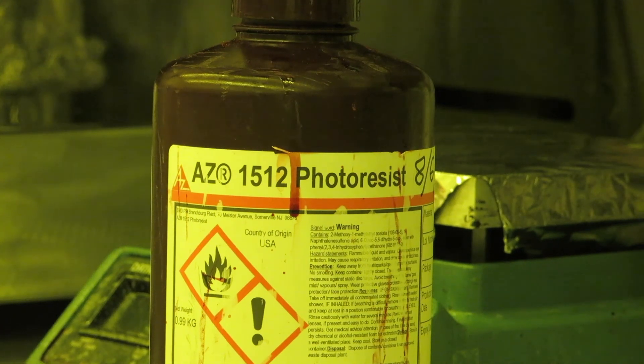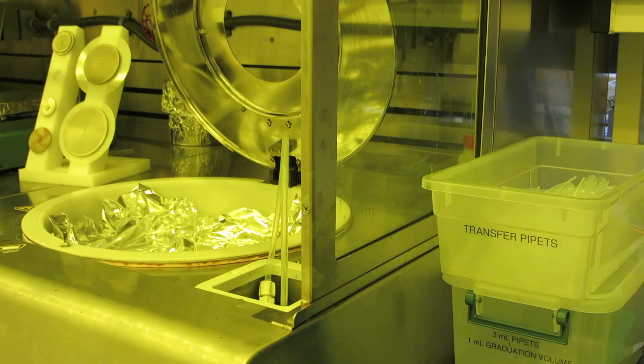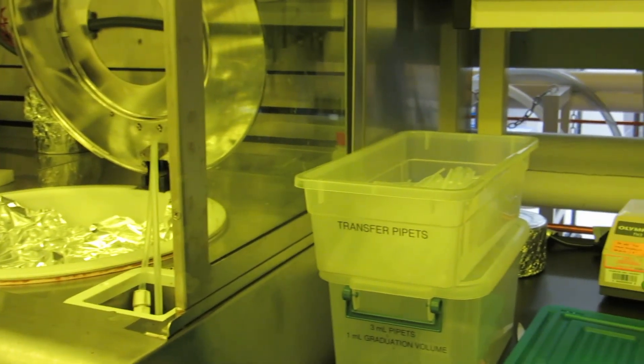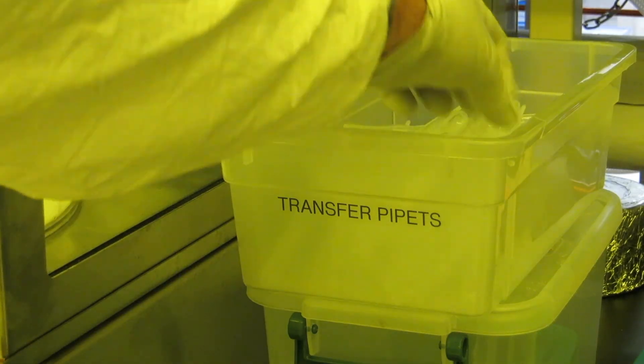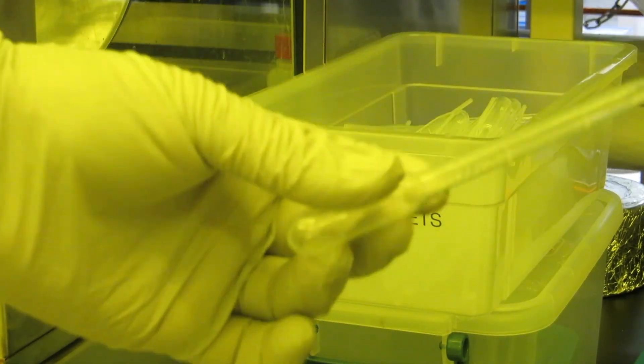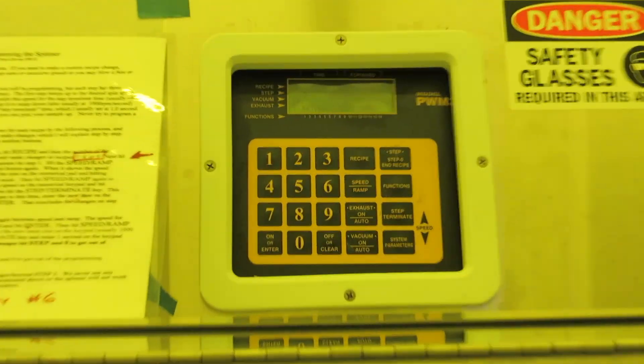To the right of the spinner are some disposable polyethylene pipettes. These work well for dispensing resist onto the chip or wafer. Before you can start spinning, you need to program the spinner.